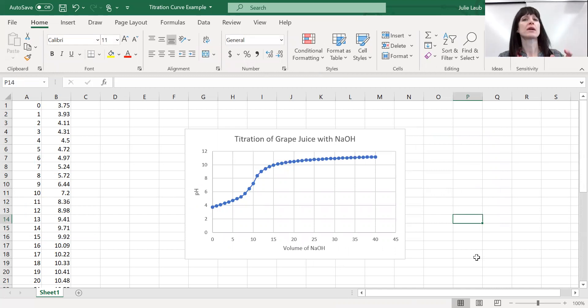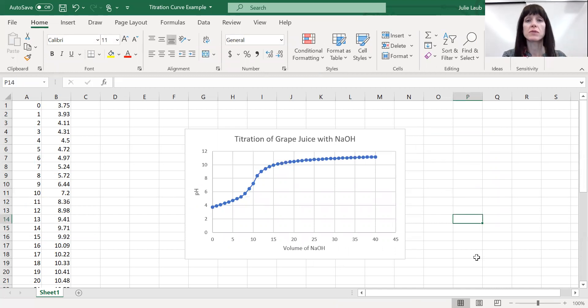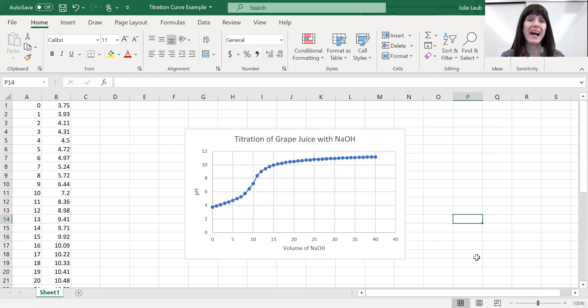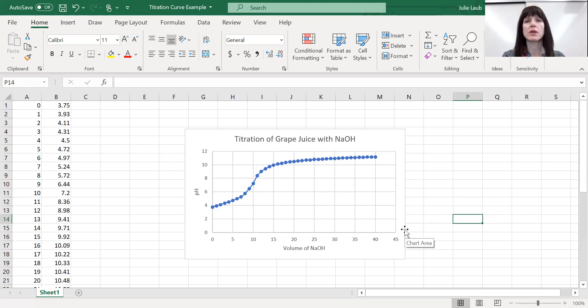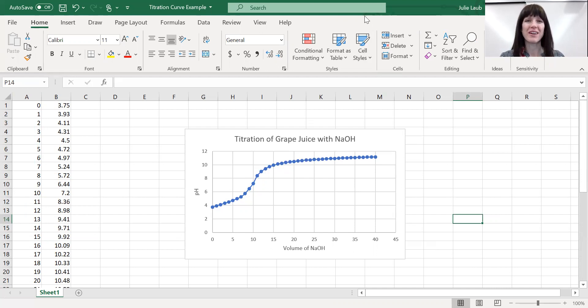I strongly recommend as you do titrations in your gen chem classes, your college classes, whether it's high school or college, take the time. It does not take very much time. Make really clean, pretty graphs, cut them out, and then you can glue or tape them into your lab notebooks. The professors and teachers will be impressed.